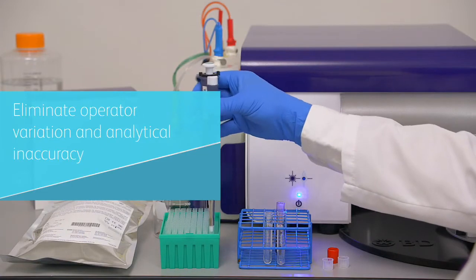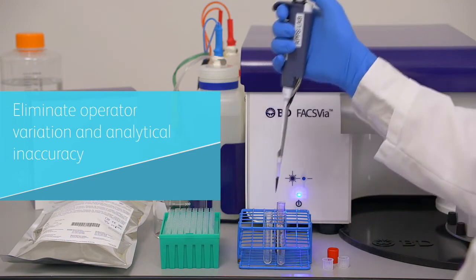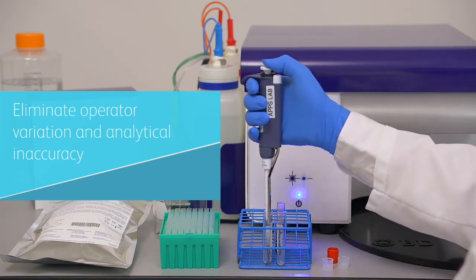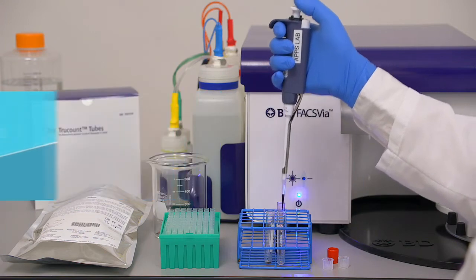Pre-optimized settings virtually eliminate operator variation, and because the system can use BD true count tubes for flow cytometry cell counting, it excels at eliminating sources of analytical inaccuracy. A single common BD platform eliminates variations from different systems.